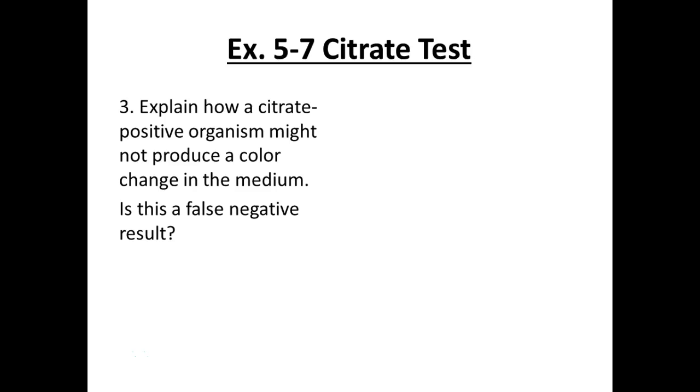So again, your plates should be read the next day, but what I do is take them out of the incubator and stick them in the fridge to preserve them for when you guys come back. And I usually take pictures.